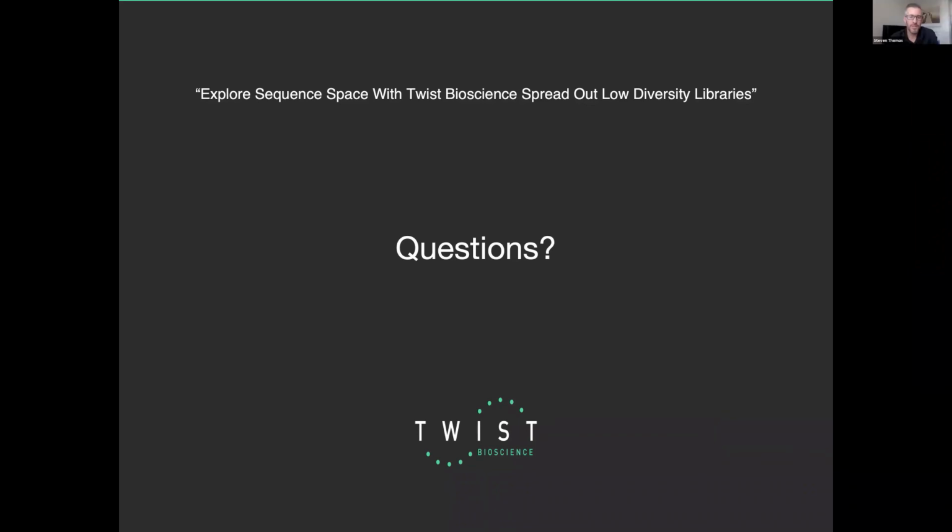So I assume this question is referring to the researcher doing the cloning in their lab, but how do you ensure the library diversity doesn't get compromised due to cloning? For us, we offer cloning at Twist for the SVLs and the CVLs, and what we typically do is we sequence the libraries before cloning, right?